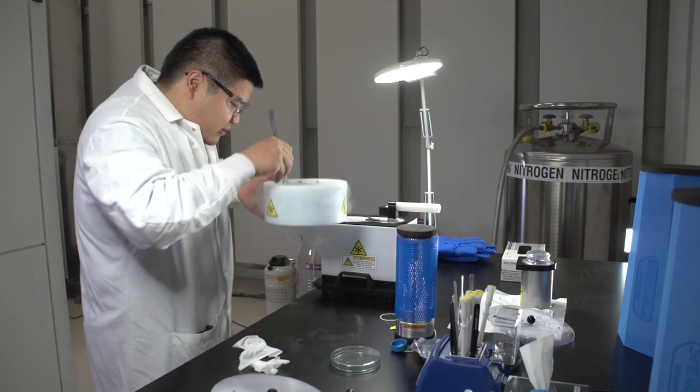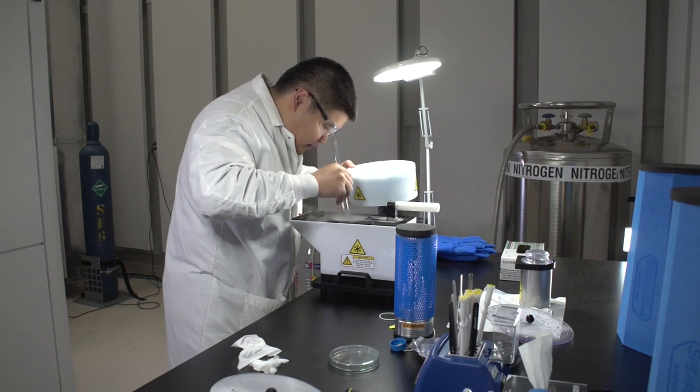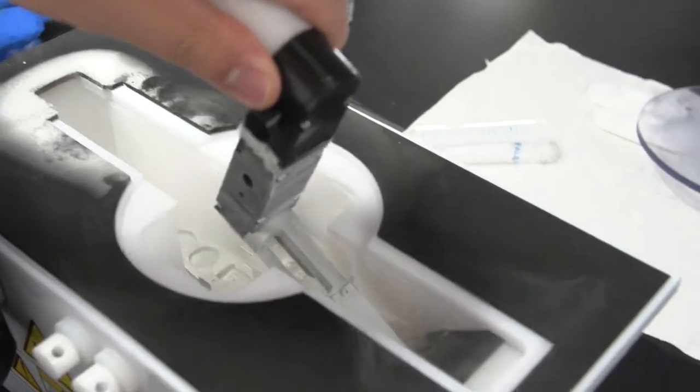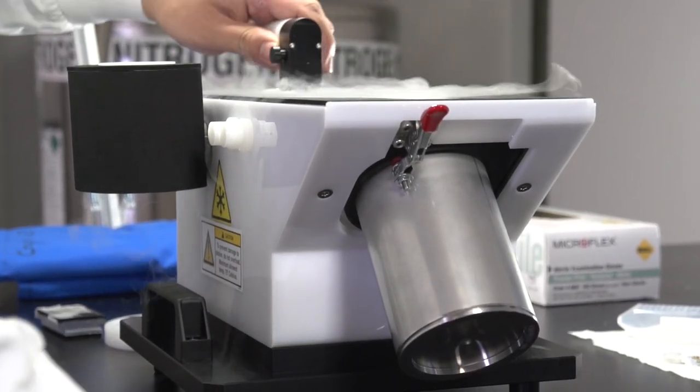Several cartridges are then loaded into a special cassette. Up to 12 grids can be loaded at a time. The cassette is inserted into a cryogenic container that is used to shuttle it into the microscope autoloader.